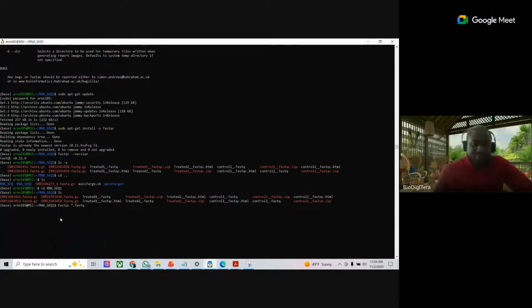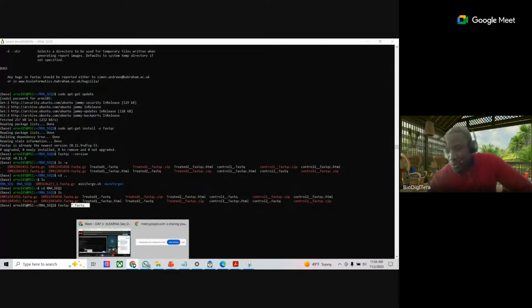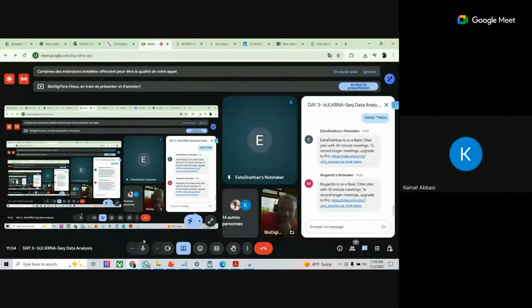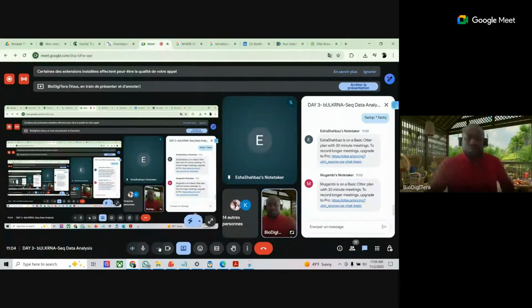And you will have. I give you 2 minutes to do it. Who has done it already? I've done it. What are you seeing in your folder? Can you share your screen? If you want to share, I can give you the floor, you share your screen.